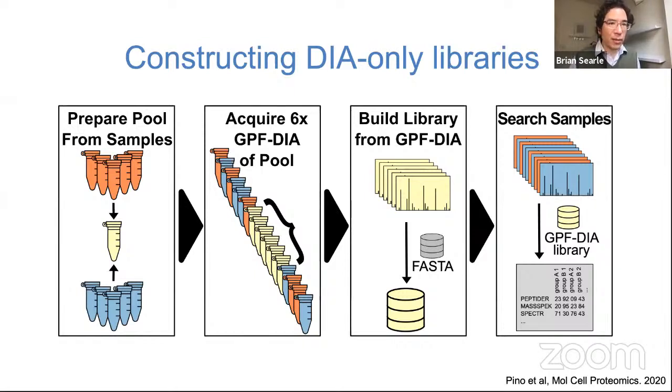We're actually at the point now where realistically, in very few circumstances do you actually need heavy labeled isotope peptides to be able to use as retention time standards. You oftentimes need to use them as quantitative standards in certain circumstances, but that's not really what IRTs are about anyway, right? We're just focused on monitoring retention time in these cases.